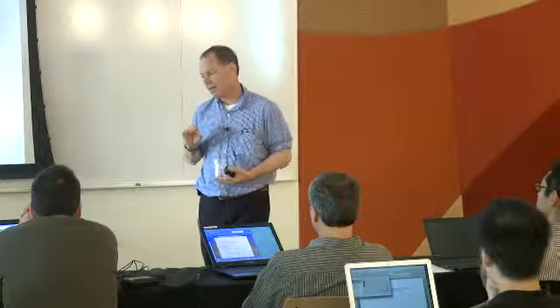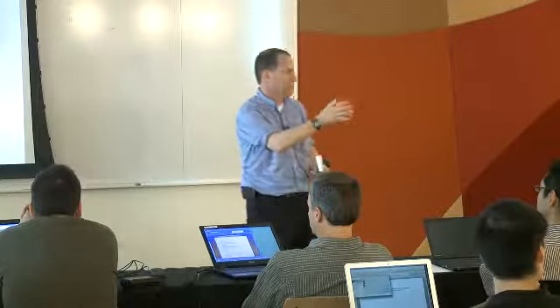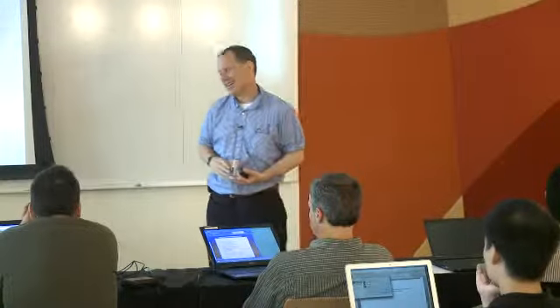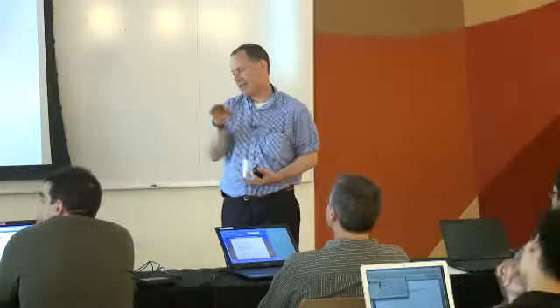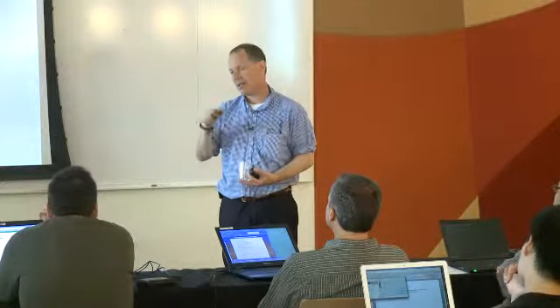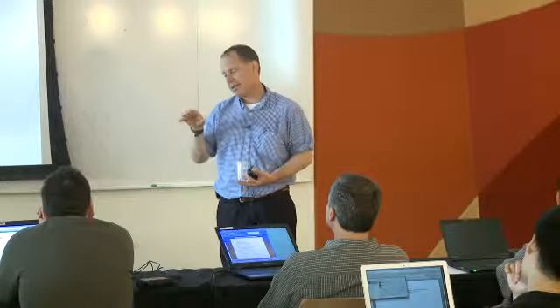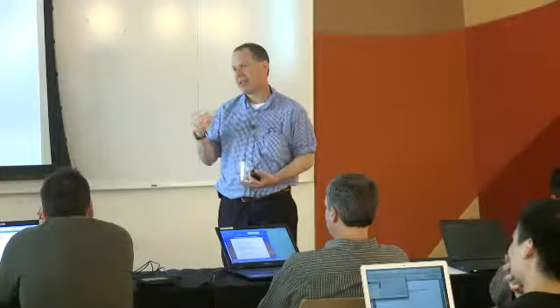But the other advantage, articulated by Anshul Kundaje, is that by sequencing longer, you get a chance to interrogate the sequence some distance away from the actual end of the fragment that you're studying, and that might be in the region where genetic polymorphism is most likely to be interesting.